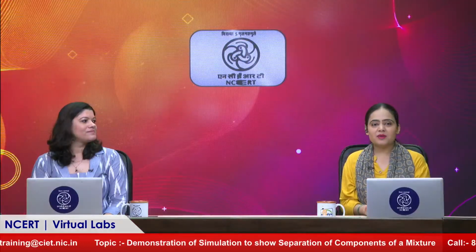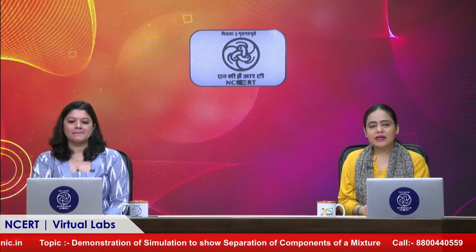That's right. Even in our daily life, I mentioned that we are getting clean water by using the boiling and filtration methods. So these virtual labs are not just helping us perform the experiment, but are also giving us the knowledge and the skills to think critically about how these methods can be used in real life also. Great. So, ma'am, we can go back to those questions since we have some moments left, and we can get the right answers now that we are well versed with the theory and the simulation.